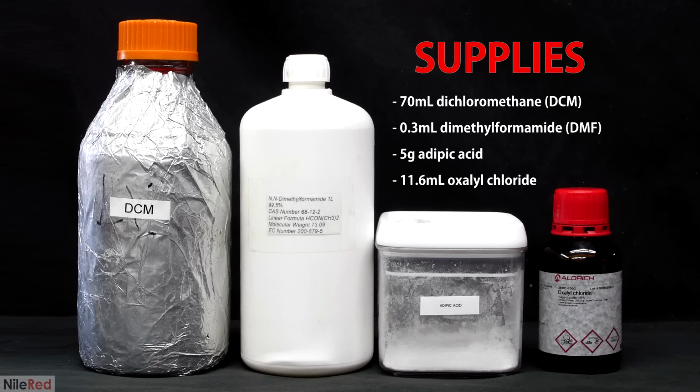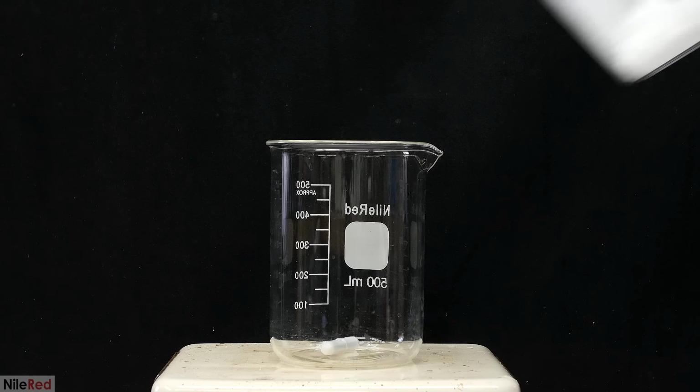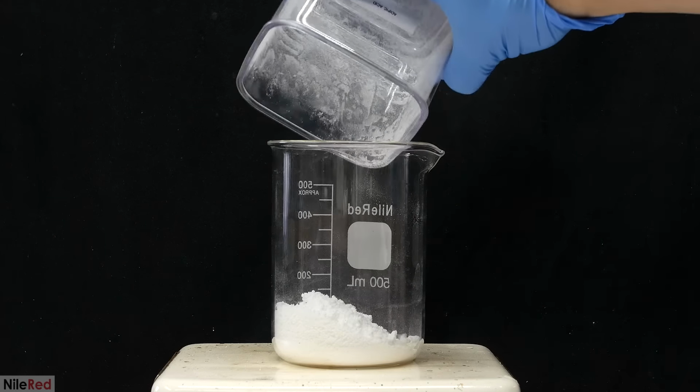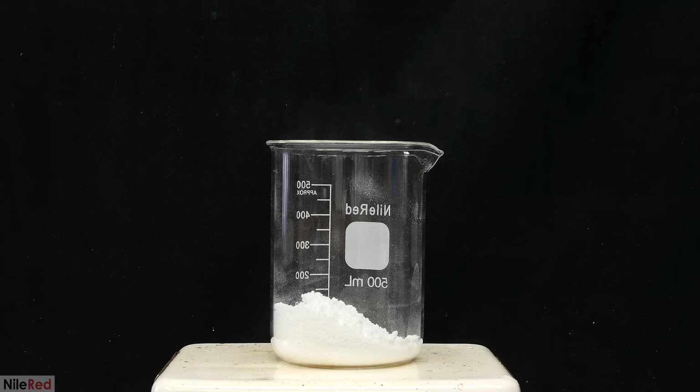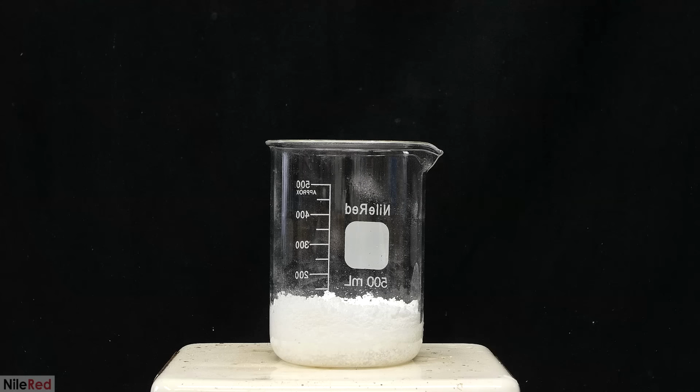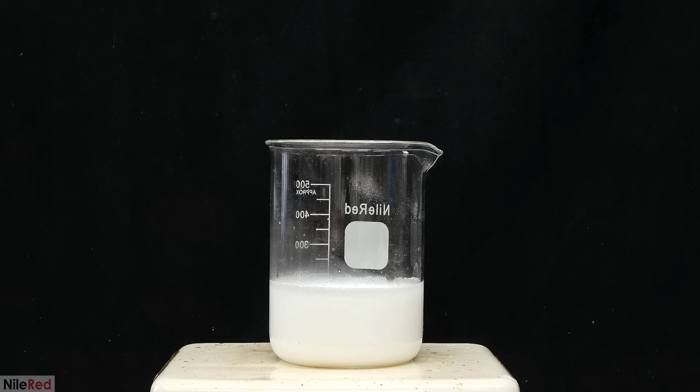A lot of them are listed as precursors under the Chemical Weapons Act, so they're not exactly the best thing to own. The adipic acid isn't super pure, so before getting started, I decided to clean it up a little. I dumped it all into a beaker, and then I added a whole bunch of distilled water. Although adipic acid isn't very soluble in water, we still don't want to add too much here.